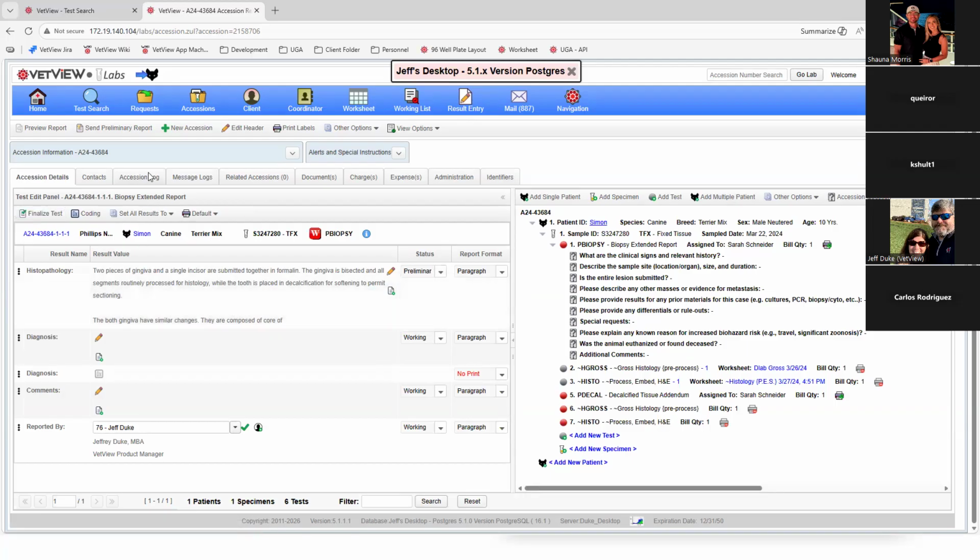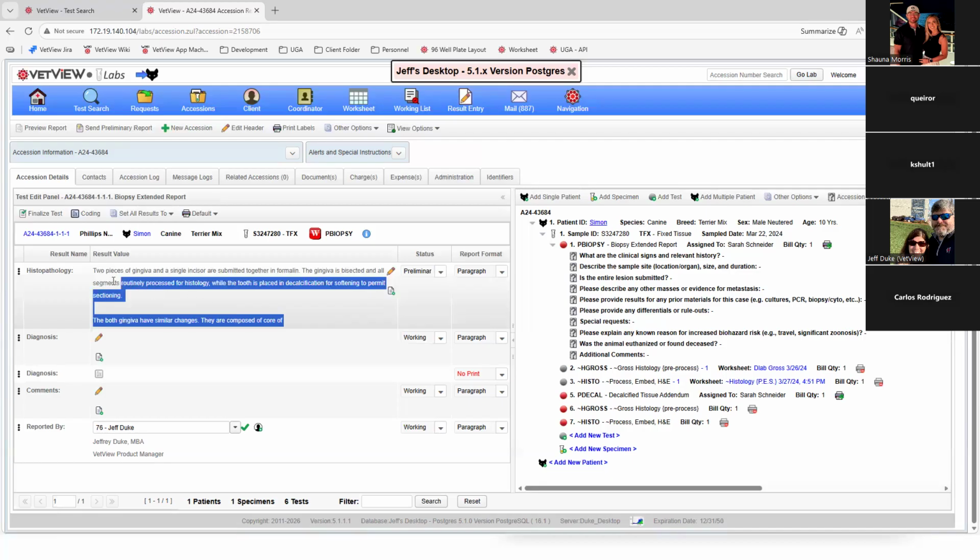And at that point, if I hit the send preliminary button or the client were to go to the portal and pull their report, this would be visible to them to read, but anything else would not be.